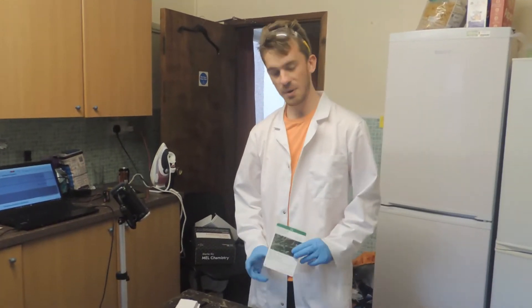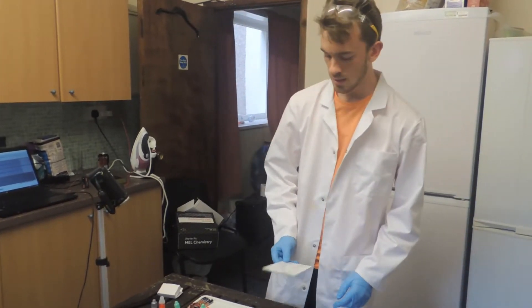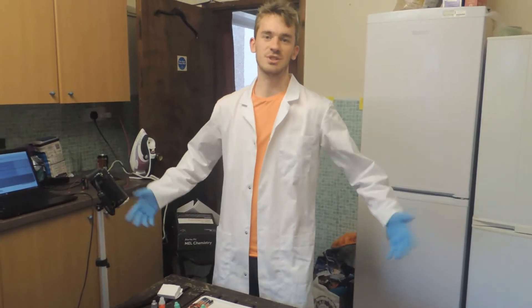Today we're doing the second experiment with our MEL Science kit. We're going to make some tin trees in this petri dish down here. We'll just get started right away.